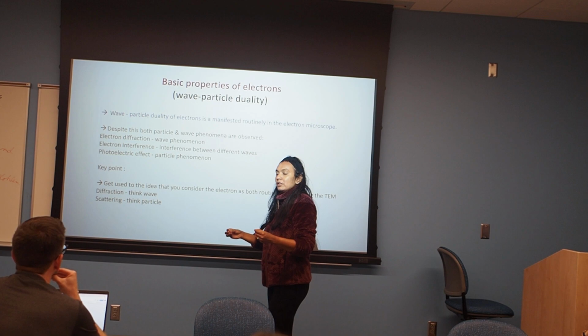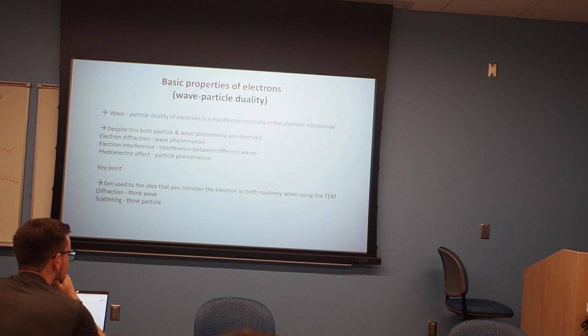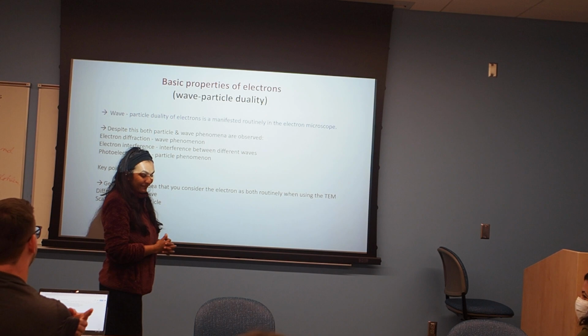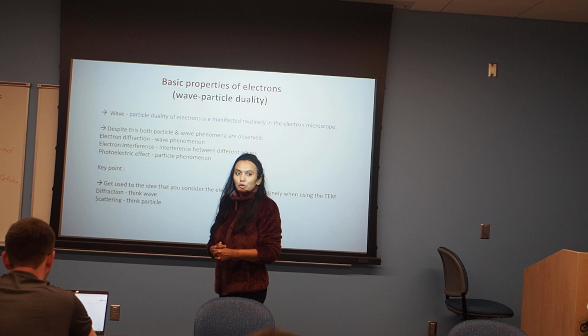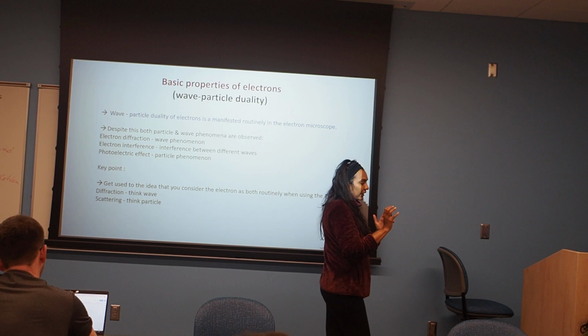What is the resolution that we can get with the microscopes that we have at UT? Any idea? Kind of cheating, as Dr. Zinkel talked about earlier in this conversation with Gerd. It's 0.1 nanometer. That would be the best bet. And when you see a 0.1 nanometer thing, you only see black and gray small atoms, and if the image is not taken properly, it's just an image, right?